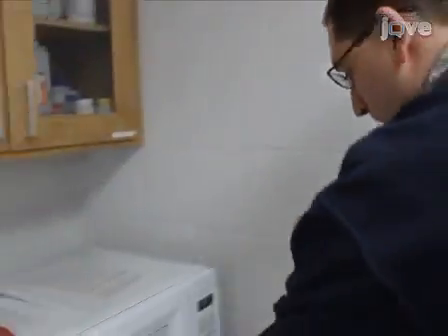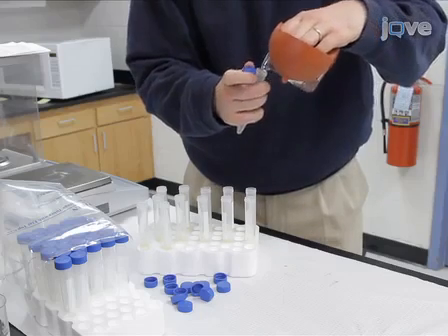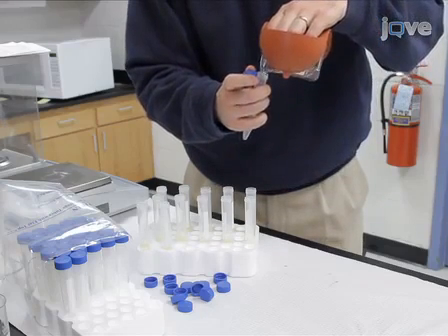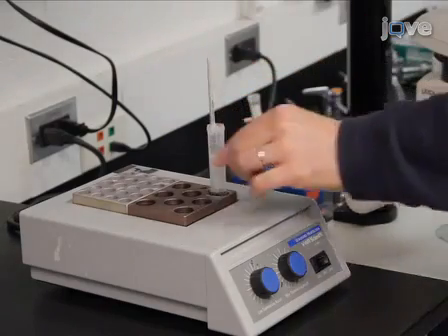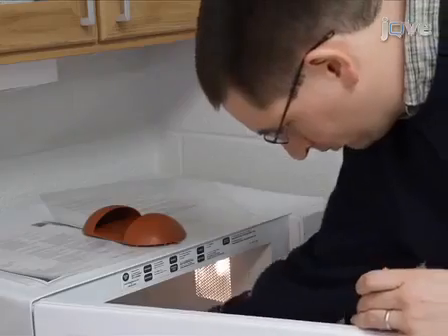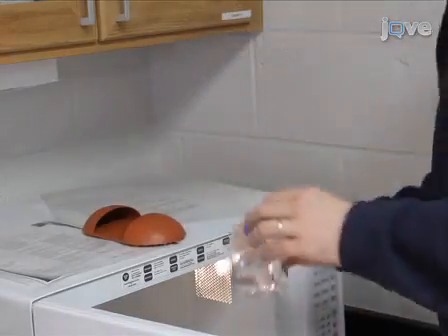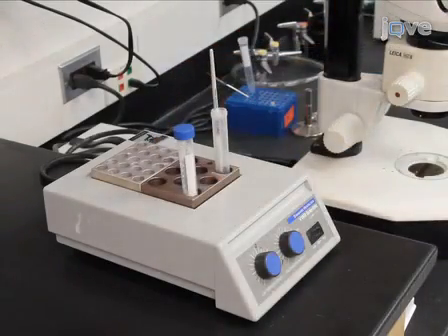Being careful to avoid boiling, both stock solutions are melted in the microwave and then stored as 4 to 5 milliliter aliquots. On the day of imaging, melt an aliquot of Vaseline solution in a 65 to 70 degrees Celsius heat block and melt one aliquot of agarose solution in the microwave, again avoiding boiling. Then, to keep these solutions molten, store them in a heat block.